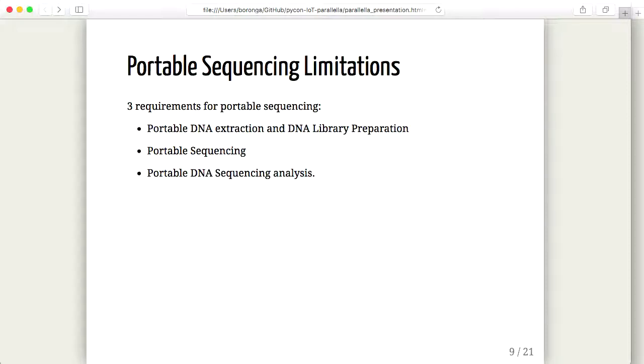But unfortunately, what we've found is that the MinION really only focuses on one of the 3 things that you require for DNA sequencing. DNA itself is tightly wrapped up in our cells because it doesn't want to mutate and be affected by other things that could cause it to change and then give us cancer or something. So it's quite hard to get DNA out of a cell to begin with.